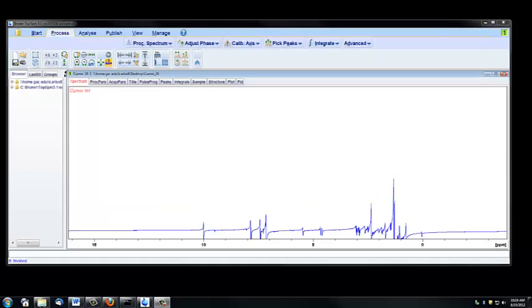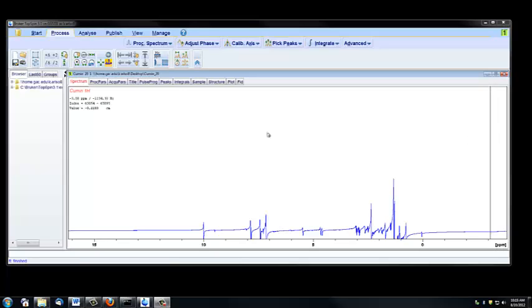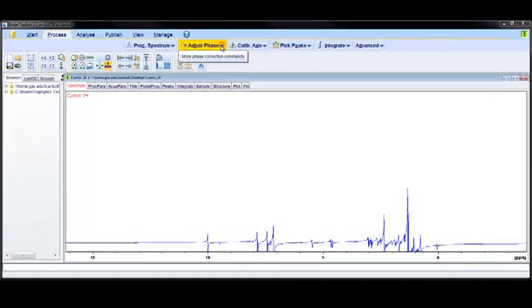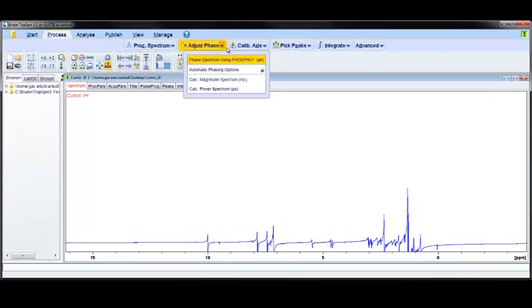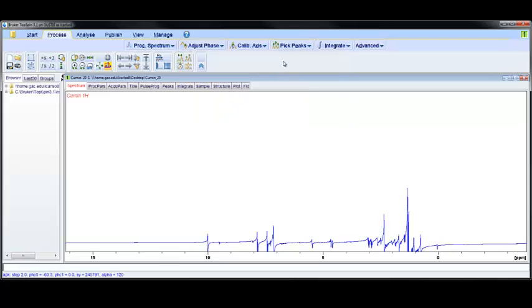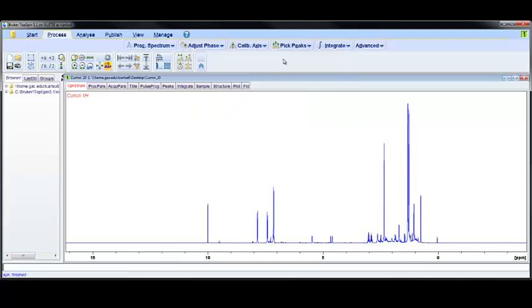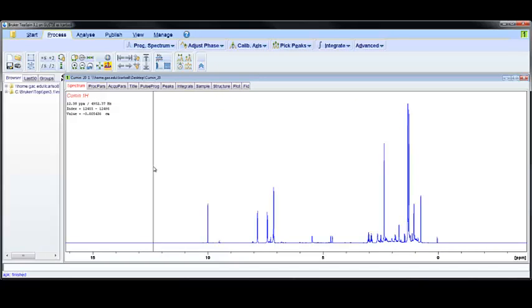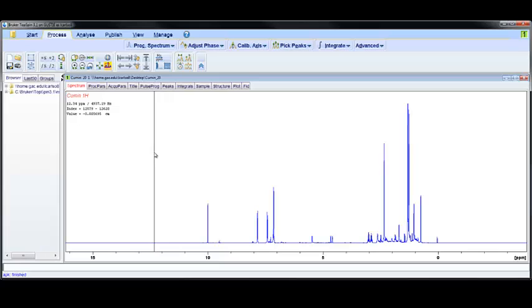The last thing that happens when we click the Process Spectrum tab is an automatic phase adjustment. If we click on Adjust Phase, this down arrow, and go to Automatic Phasing Options, and choose 0th and First Order Correction, this is the automatic phasing of our spectrum. It looks pretty good in this case, but there will be times when the phasing doesn't work well automatically and you'll need to manually adjust the phasing of your spectrum.